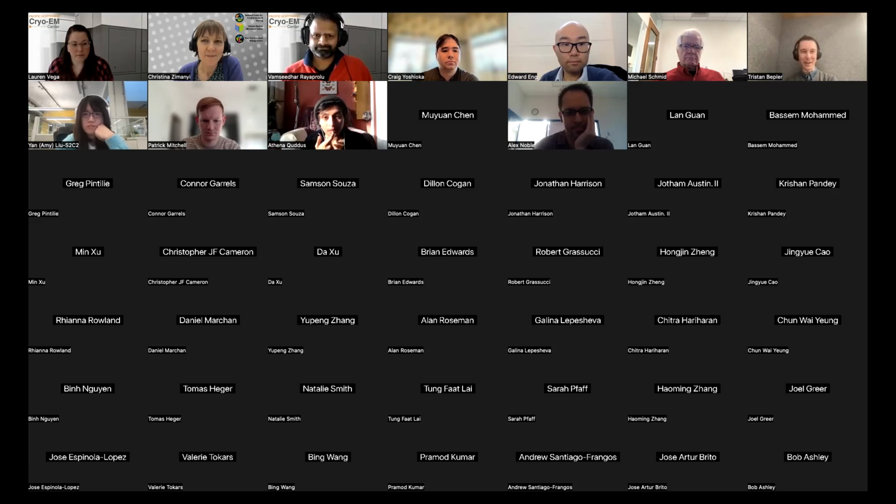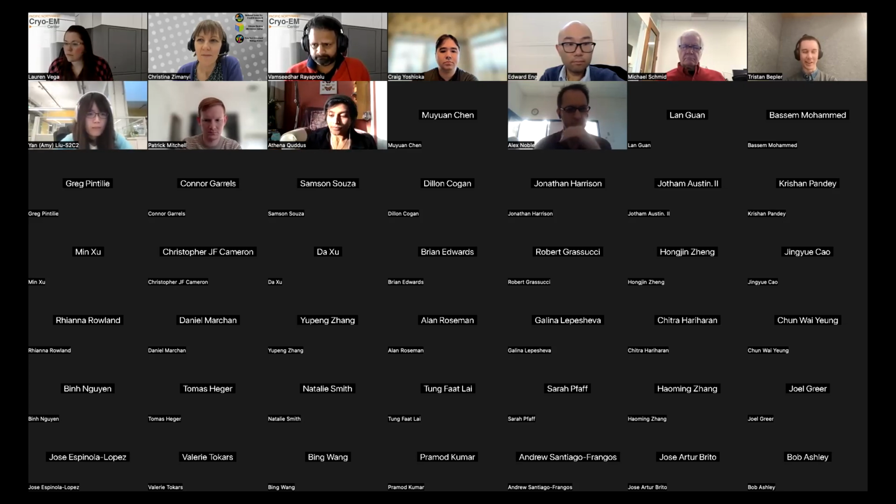We do have a beta version for tomography that is not public release yet, because I think we're still doing some testing of it and want to make sure it works well before we release a new Topaz version with that in it. But the answer is yes, we do have a beta version. So if you're interested in trying it out and are willing to potentially suffer through some, if you want to help us beta test it, feel free to reach out to me. But I think we are hoping to get that released in the next few months, basically, with the next Topaz update.